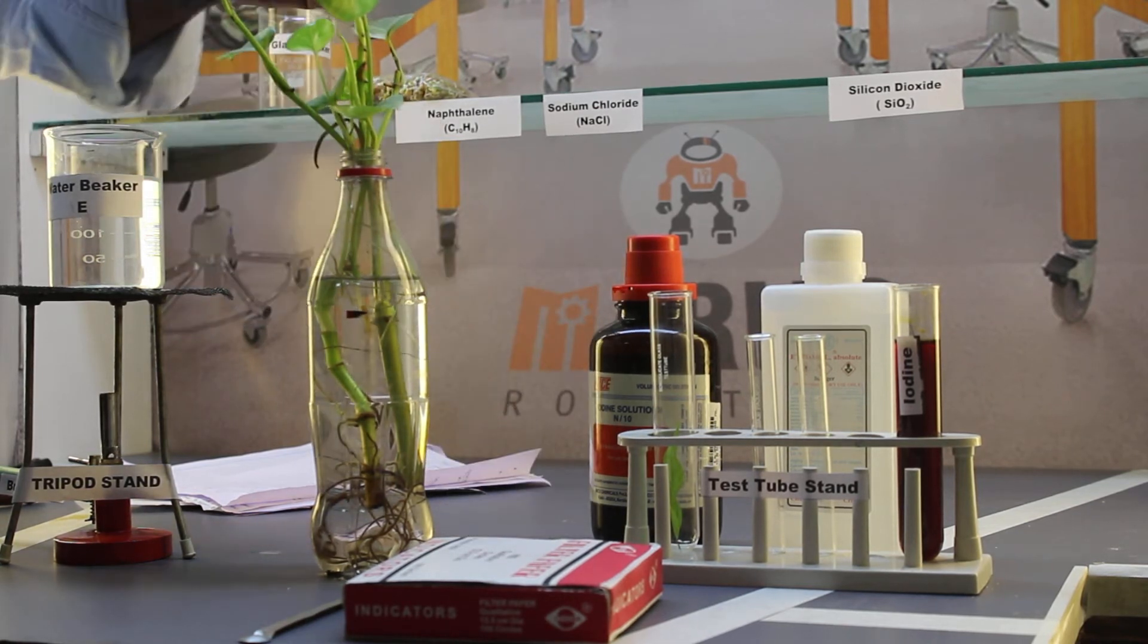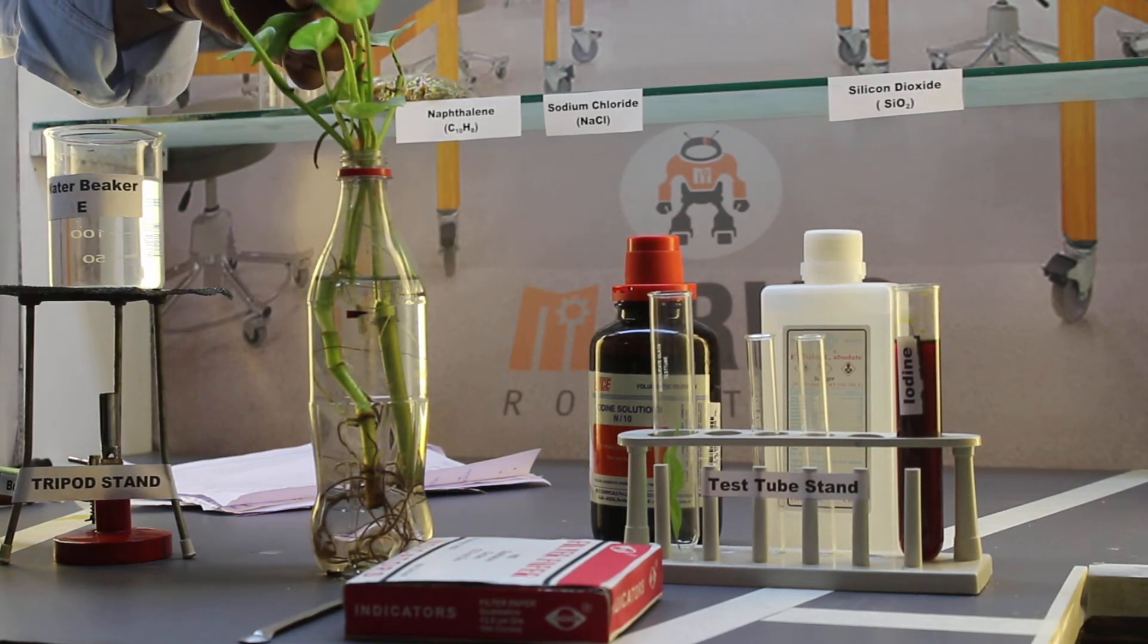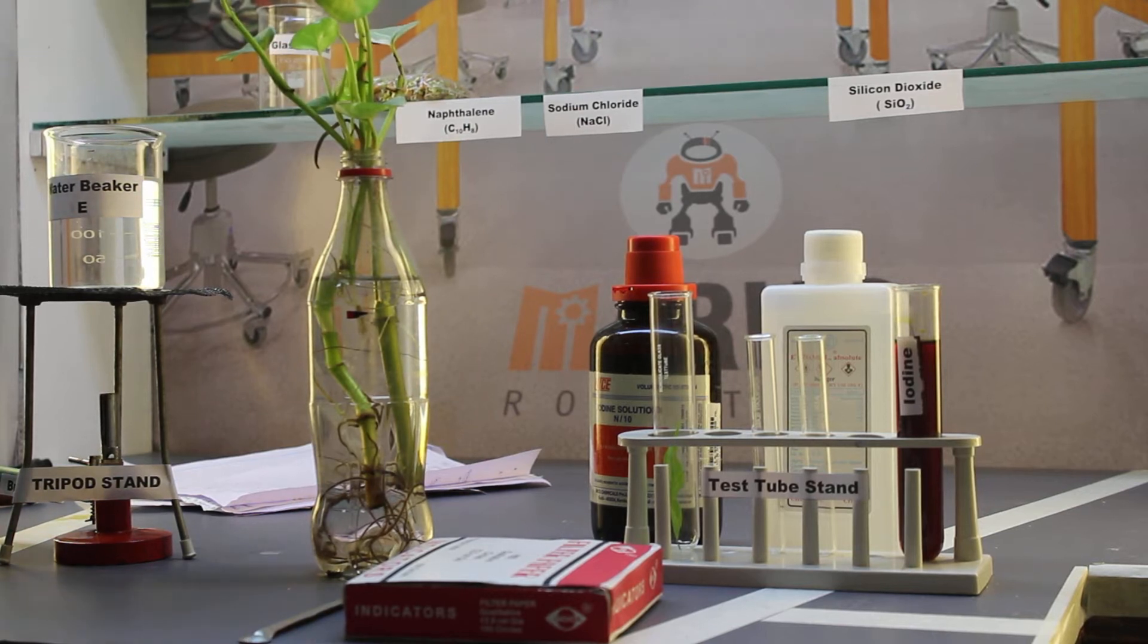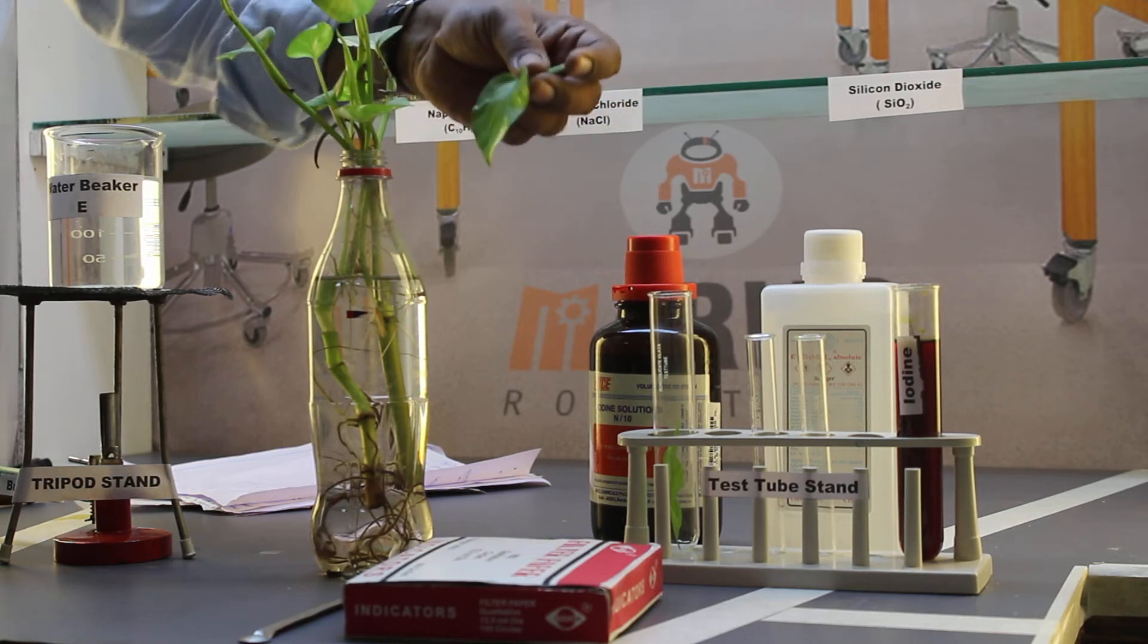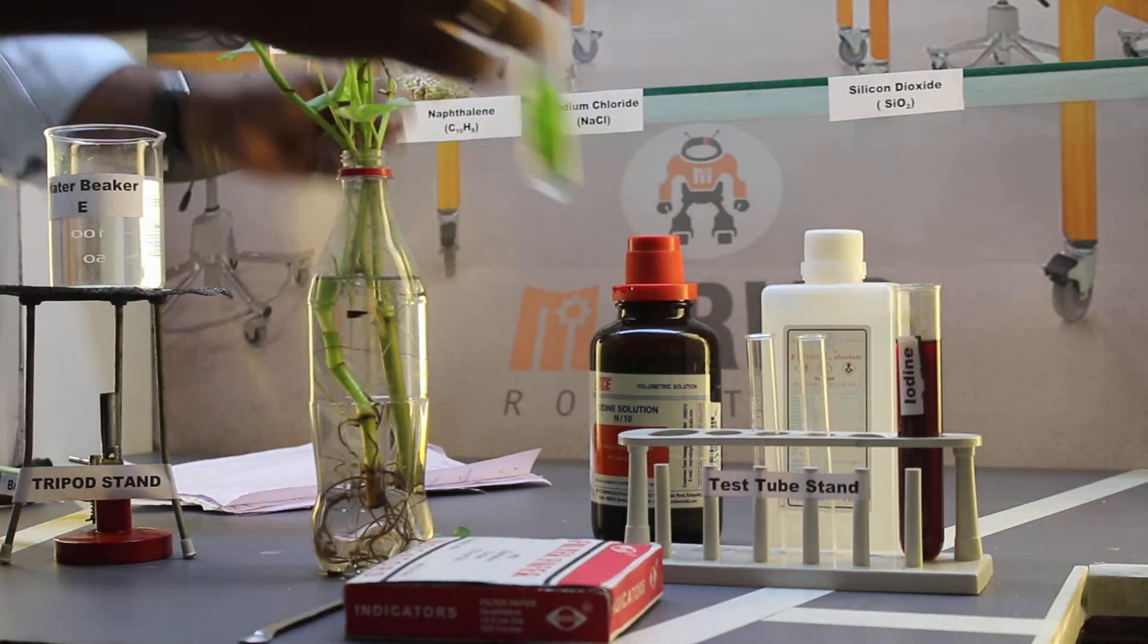Now what we have to do is detach a leaf from the potted plant. After detaching the leaf from the potted plant, keep it aside. Now take a test tube.